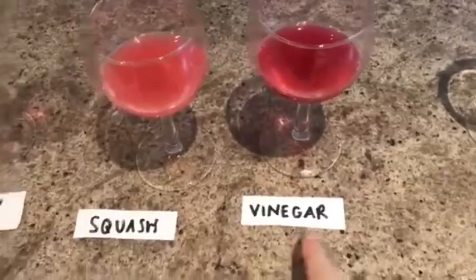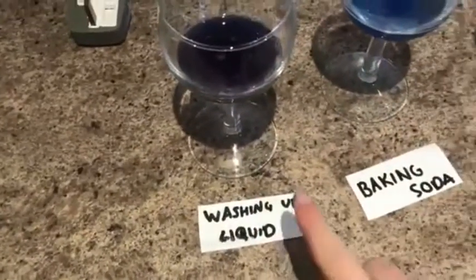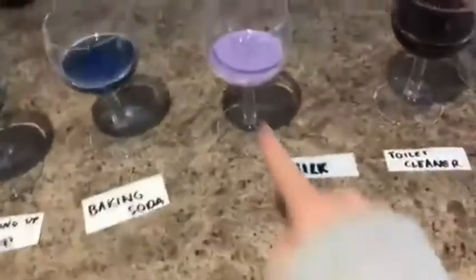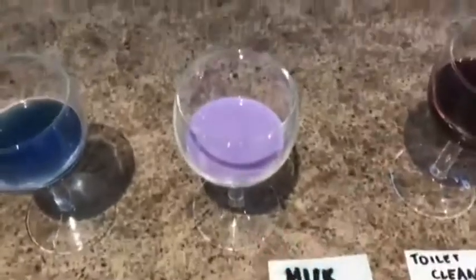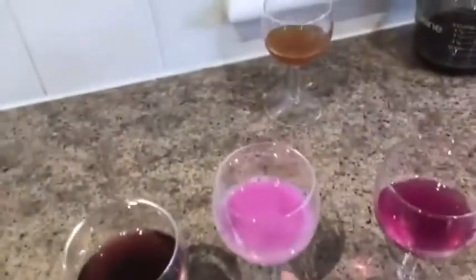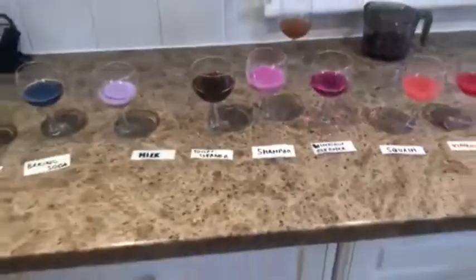So the vinegar is a highly concentrated acid, and the washing up liquid is a highly concentrated alkali. So the milk, because it's that colour, it didn't come out correct, so it's very different compared to what it should be. So it's actually an alkali. But yeah.